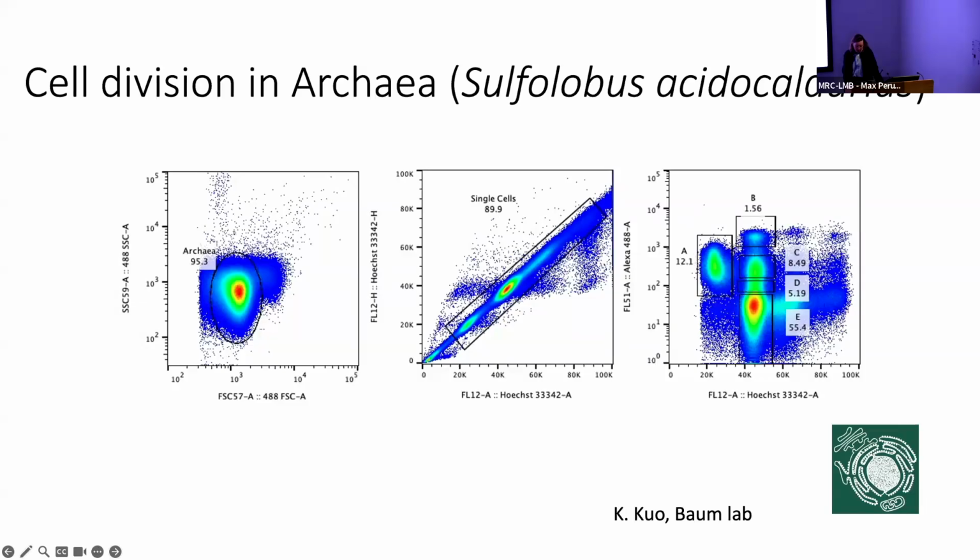And these are thermoacidophilic archaea and a facultative autotroph found in thermal soils and hot springs. And the goal of one of Chris's projects is to isolate these archaea at different substages during cell division, and to pinpoint at which substage the transcription of cell division genes are turned off.